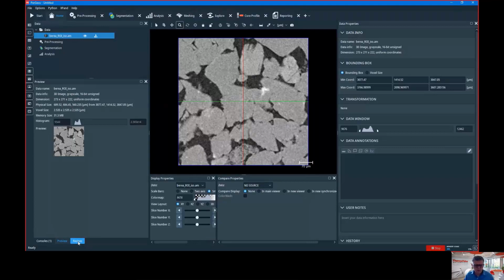If you have knowledge in image processing, you create the workflow you like with the network editor. And then you say create recipe, you save it. Next time you start Avizo, you will have that recipe available in Avizo. But when you buy Avizo, it doesn't come with any recipe. If you buy PerGeos, it comes with, let's say, 10, 15 recipes documented for specific tasks. One of the recipes is the recipe to compute pore space on micro CT. So instead of going through the demo we have seen, I'm going to use the recipe.